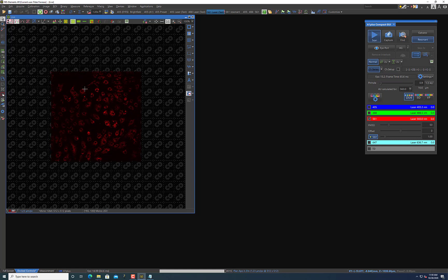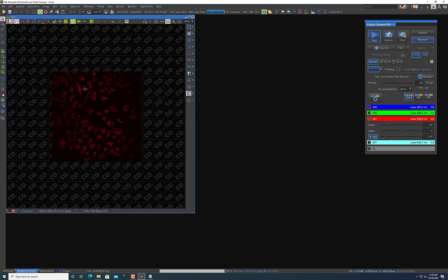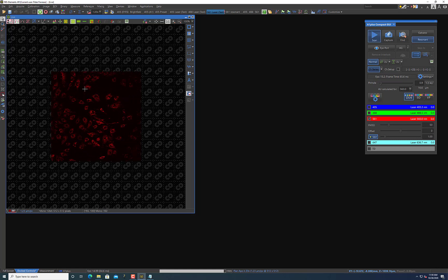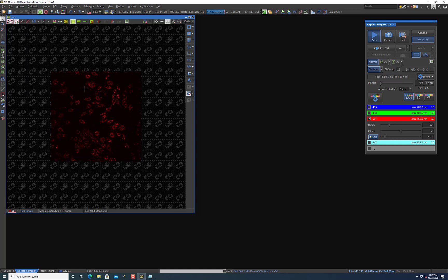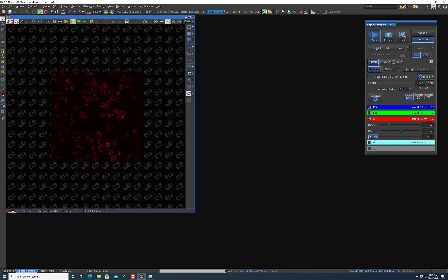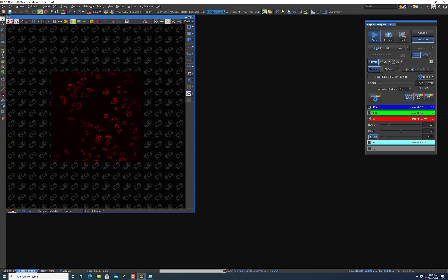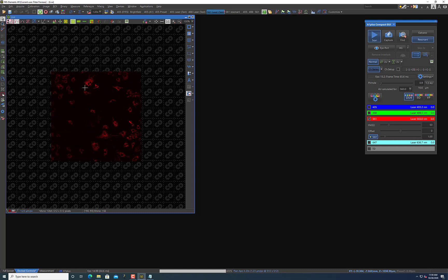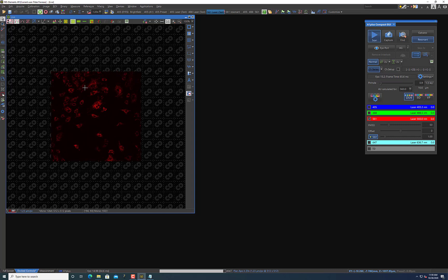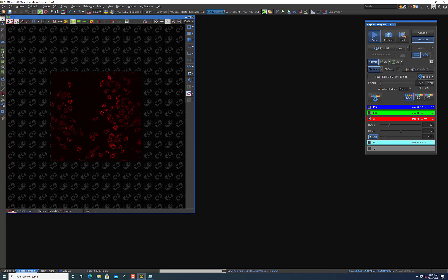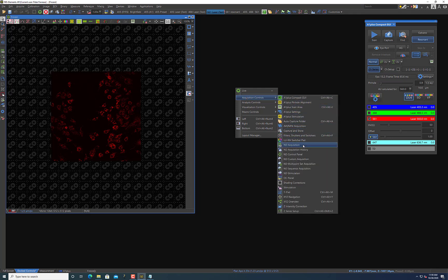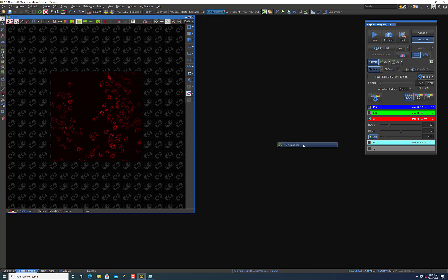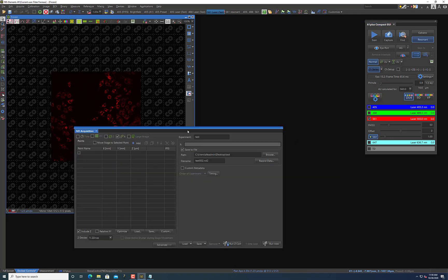And so your objective may be to take as many images as possible, and that could take a very long time to do. So with the resonant mode, what I like to do is find fields of view I like and mark them. To do that, I'm going to right-click again and go to Acquisition Controls and ND Acquisition.